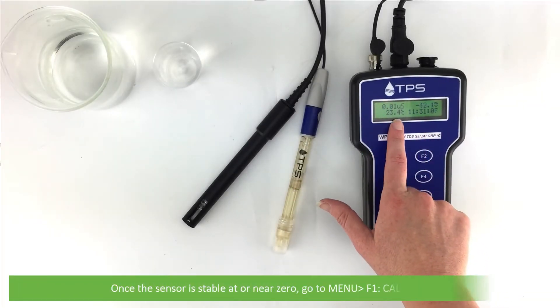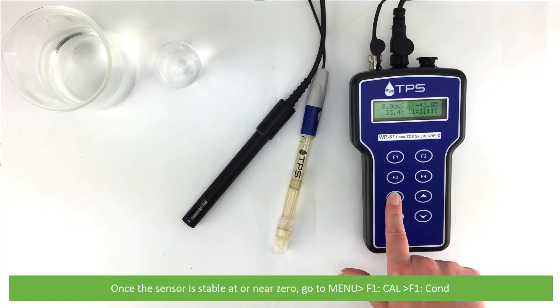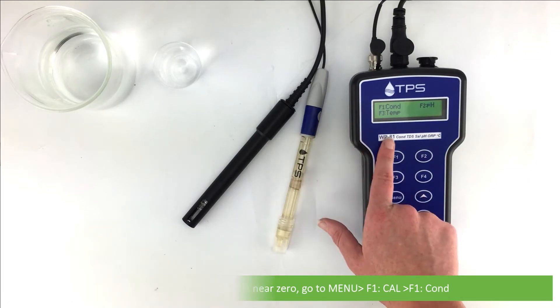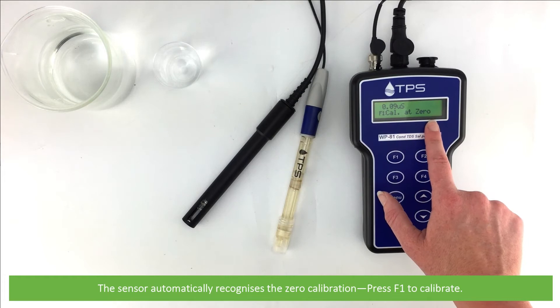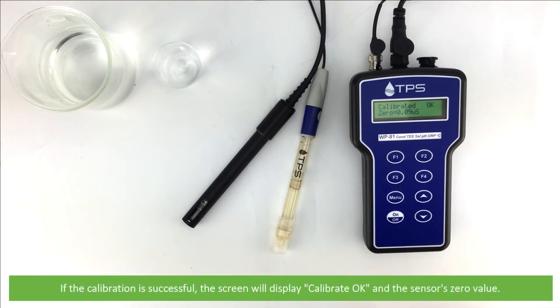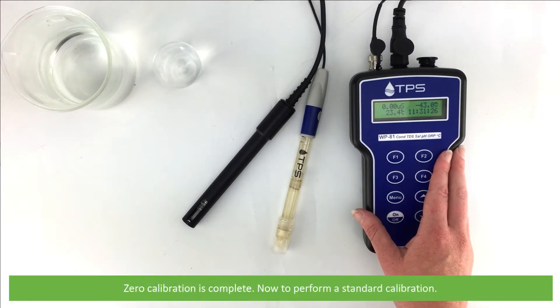Once the sensor is stable at or near zero, go to menu, F1 cal, then F1 C-O-N-D. The sensor automatically recognizes the zero calibration. Press F1 to calibrate. If the calibration is successful, the screen will display calibrate OK and the sensor's zero value. Zero calibration is complete.